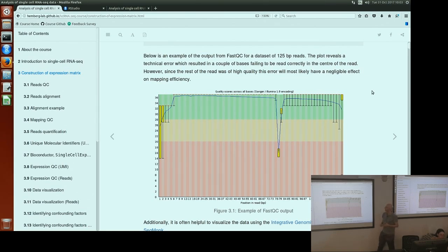We think that it is only a handful of bases in the middle where this appears to be a problem, so we hope that this should not cause too many problems for the alignment downstream. So we're just going to make a mental note of this and proceed. But if there were more errors here, you might want to consider doing more careful checks, and potentially you'd have to rerun an experiment if things were really bad.